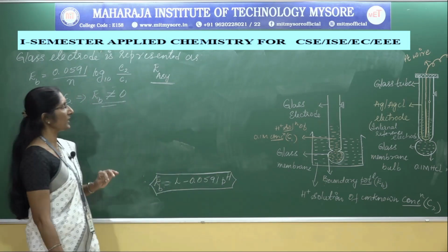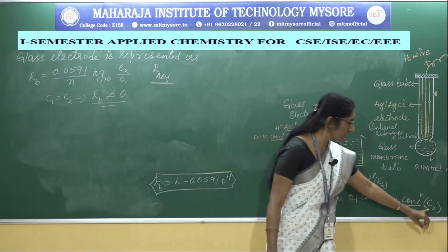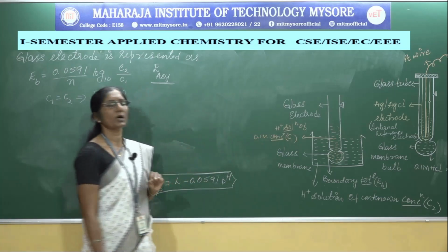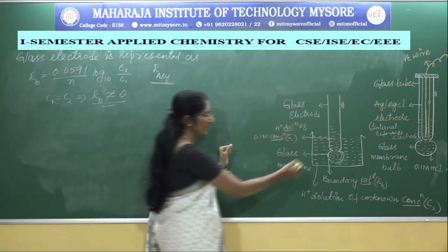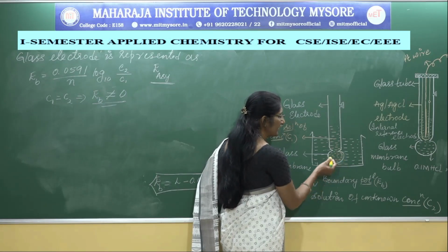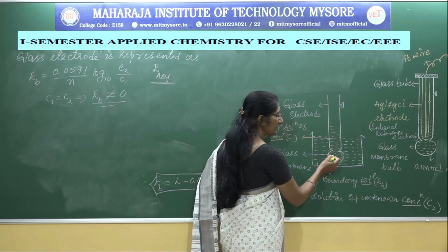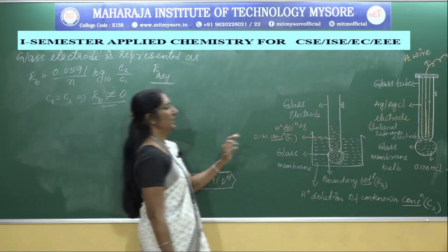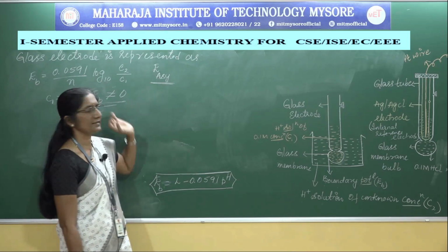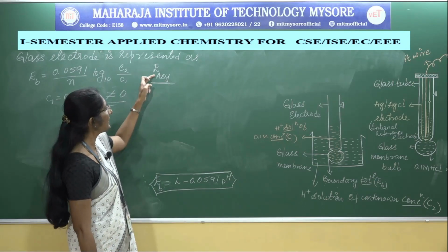It is a small potential developed when the concentration of C1 is equal to the concentration of C2. Why? Because the radius of curvature of this glass bulb is different inside as well as outside. So H plus ion activity is different. Due to this difference in H plus ion activity, it develops a small potential, the asymmetry potential.